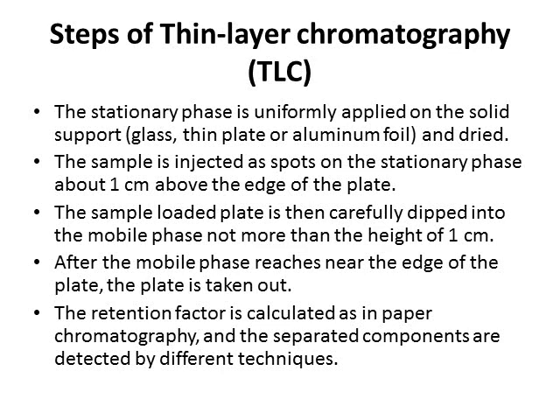Students, I hope you are able to understand that paper chromatography and thin layer chromatography are almost the same. In paper chromatography we use a cellulose paper instead. Here it may be a thin plate made of glass or aluminum foil, right?